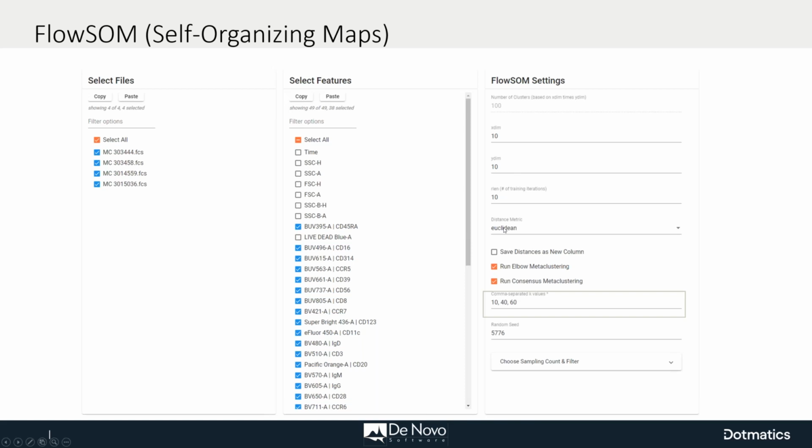There's the ability to use different distance metrics if you're looking at different data types. So some people doing machine learning are comparing pictures of dogs to pictures of cats, or different handwriting samples between people, or different yields from different oil fields or whatever. Those might use a different distance metric, or might be more effective with a different distance metric. Euclidean is basically almost always the one you want to be using for cytometry data. So you can leave that one alone.